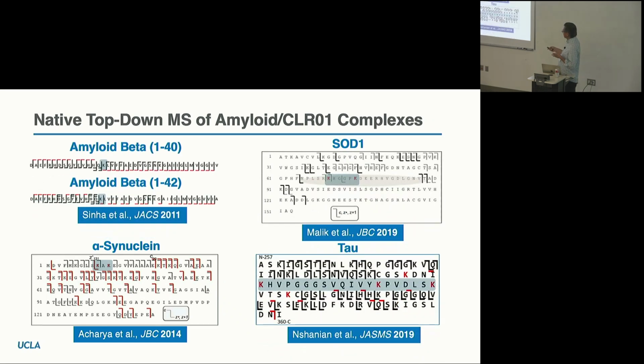And then we did that same experiment with amyloid beta. This is superoxide dismutase in Lou Gehrig's disease, tau protein, and tauopathies. And these gray regions represent our best guess on where these molecules bind in the sequence of these proteins. It always binds to a lysine residue because this molecule was designed to bind directly to lysine. And so it doesn't bind to every lysine residue, just to certain lysine residues in the polypeptide sequence.